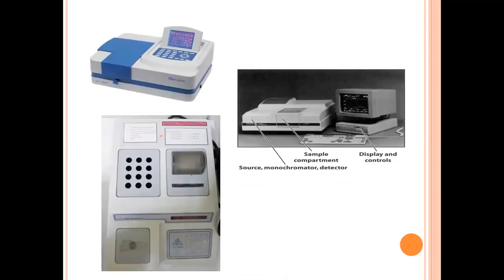And you have also the display and controls. And this one. Okay? So the last picture, okay, na nakita nyo is actually the spectrophotometer we have in our lab. So, nung student ako, iyan yung ginagamit namin. However, ngayon, sira na siya. Okay? Kaya we cannot let you use that anymore. Kaya we have that new one. The one shown to you doon sa ating video. Okay?